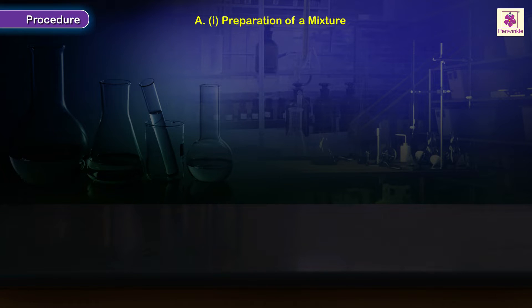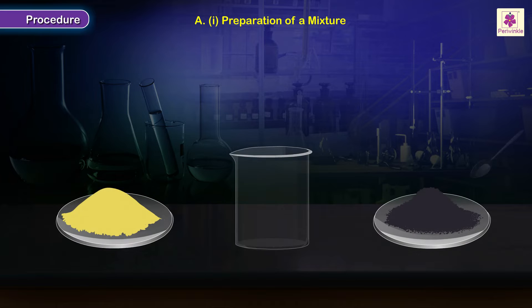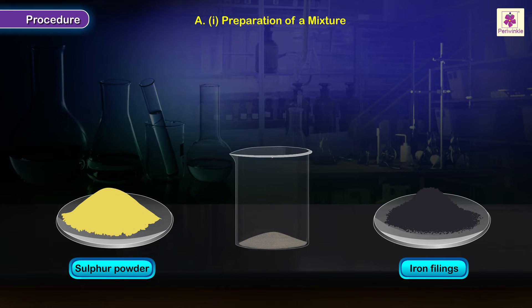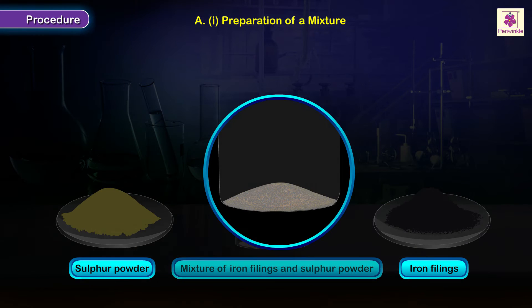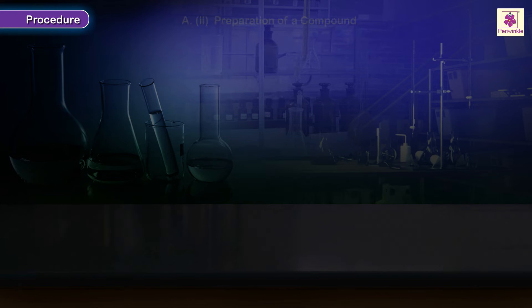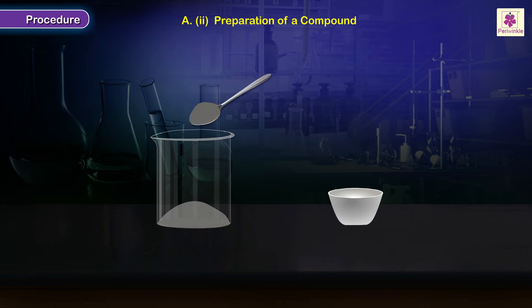Procedure for the preparation of a mixture of iron filings and powdered sulfur: place some iron filings and sulfur powder in a clean beaker. Thoroughly mix the contents of the beaker. The mixture of iron filings and powdered sulfur is now ready. Label this as Sample A.